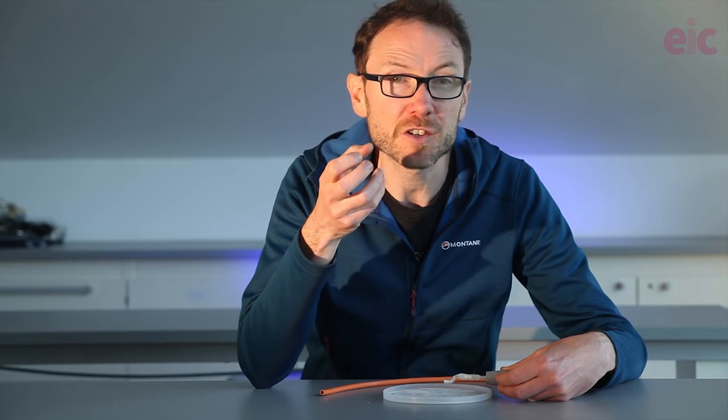You should not puff the sugar by mouth or invite students to perform this demonstration. There are short-term exposure limits to breathing the dusts that will definitely be exceeded this way.